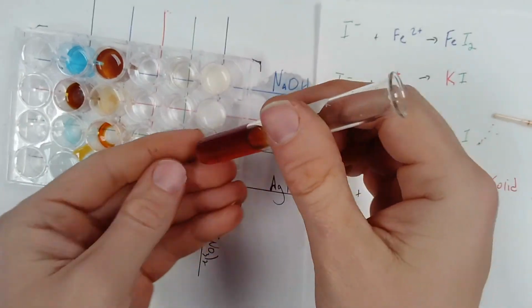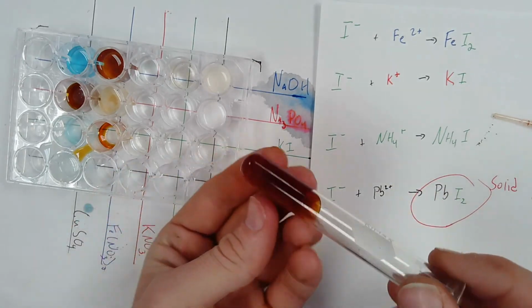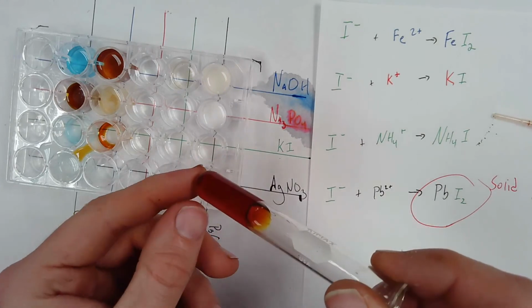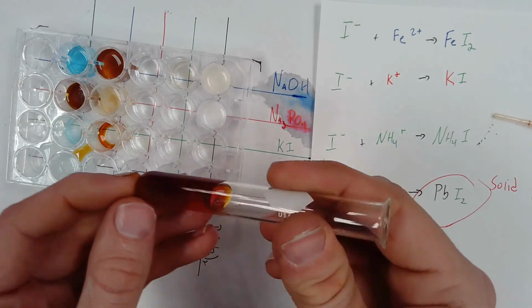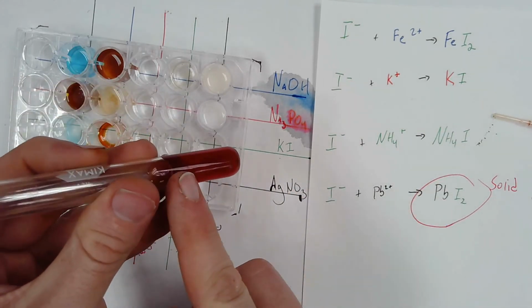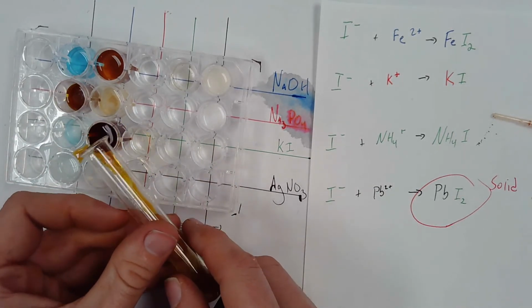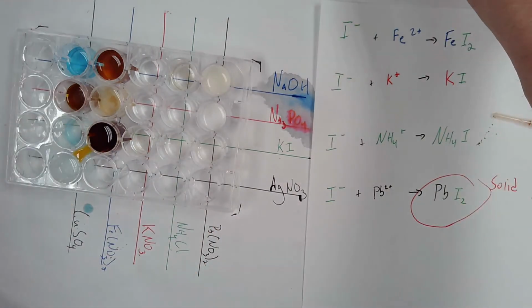And here's our first weird result. Now, we said this would not make a precipitate. And check it out. It didn't make a precipitate. See how you can still see my hand through there? See how it didn't separate out into a clear layer and a solid? Even though there was a little color change and all that going on, even though it kind of looks like grasshopper spit, nothing there. No chemical reaction in terms of making a precipitate. So our prediction was right, even if it looks a little confusing. All right, let's do the other ones. They're a little easier.